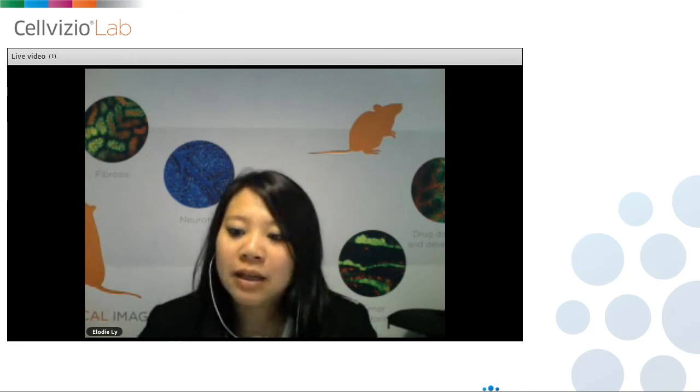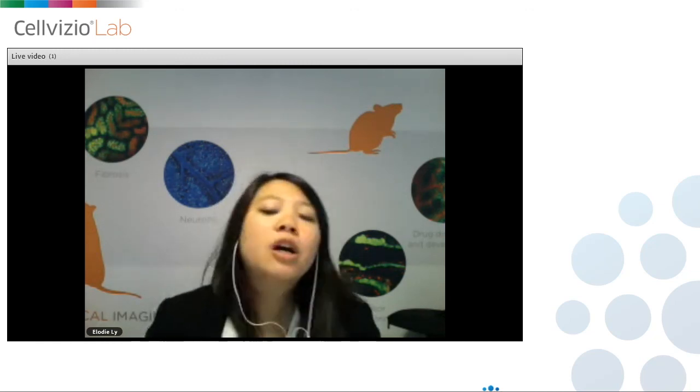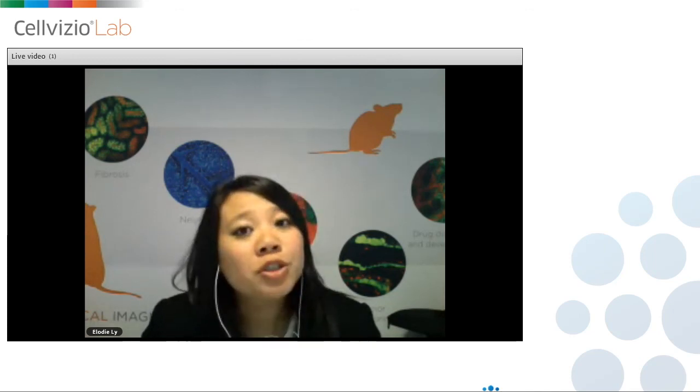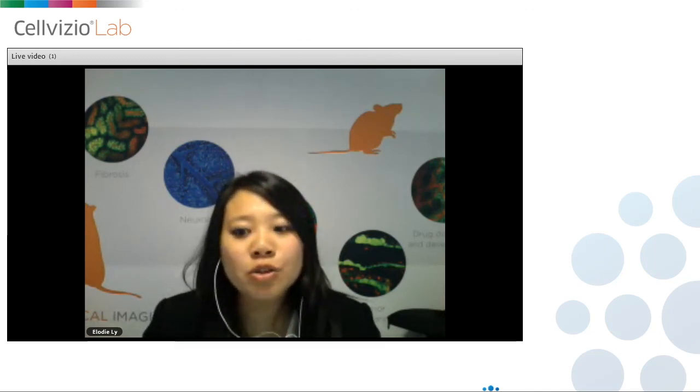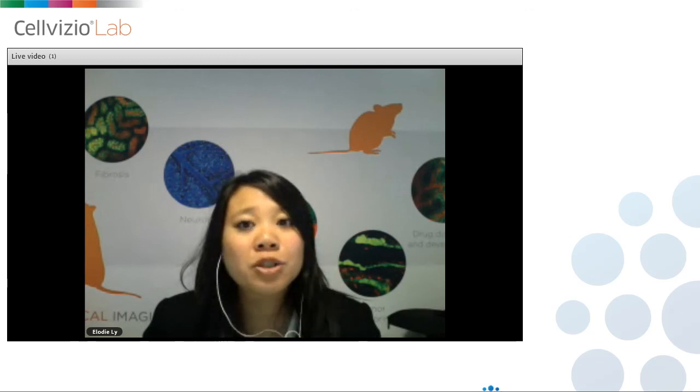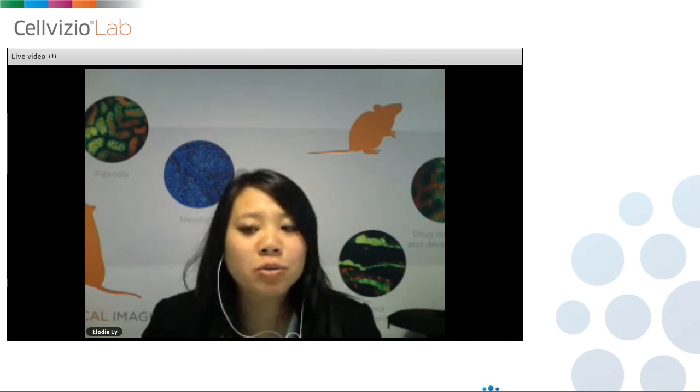And I have other questions. Whether or not the resolution of our instrumentation is enough to image bacteria. Yes, the resolution that we have is a cellular scale resolution.